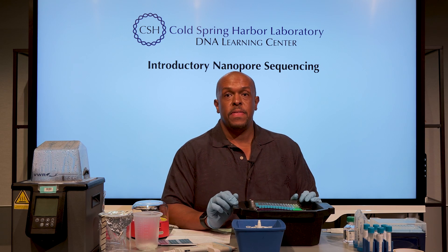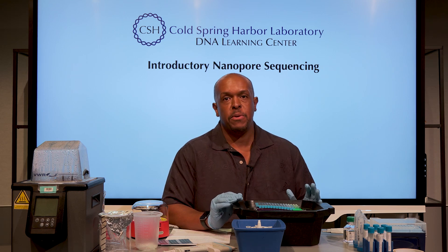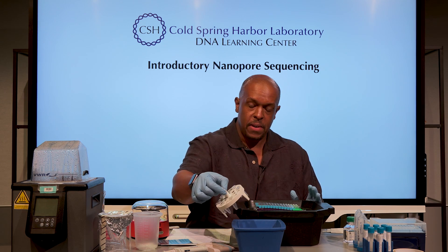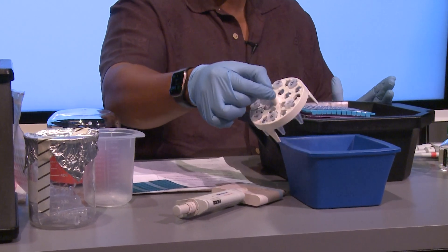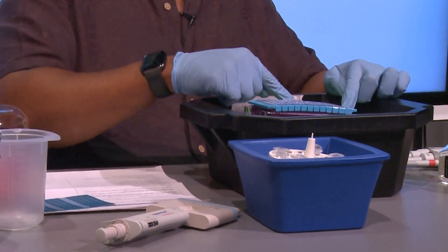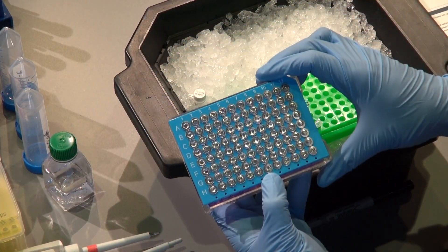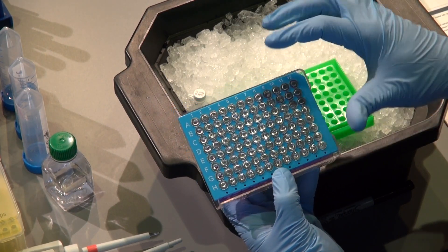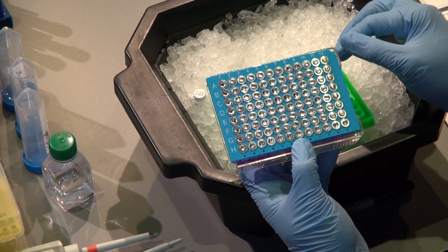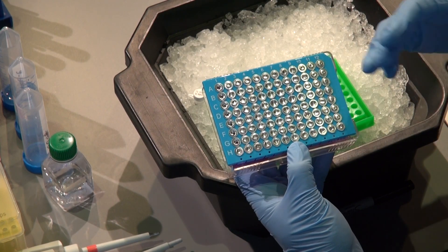We are now ready to use some of the components of the nanopore 16S kit. We have the primers here, and in this demo we prepared our microbiome samples — the end stage being getting to DNA that we can amplify. From the nanopore kit I have this array of primers: they give you a 96-well plate, and every three wells are actually barcoded primers. The current configuration allows you to do six reactions, so you have enough to do several plates.